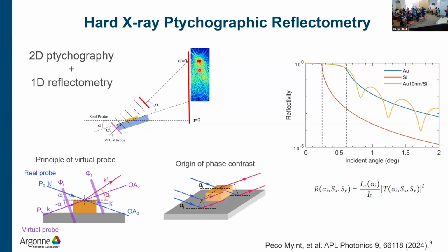I think I should shift the image taller a little bit. But anyway, you have a lot of diffuse scattering around it. These are all speckle patterns. For each incident angle, you will scan this sample because our samples are larger than the footprint of the beam. You do two-dimensional rastering scans of the sample, then get a bunch of ptychography images you can do reconstruction on.